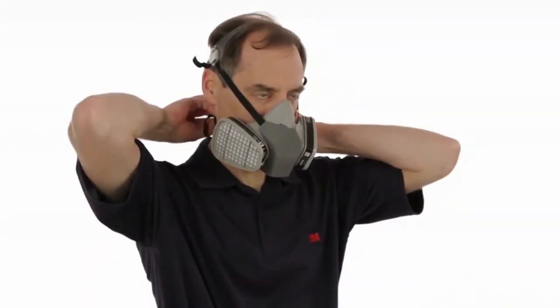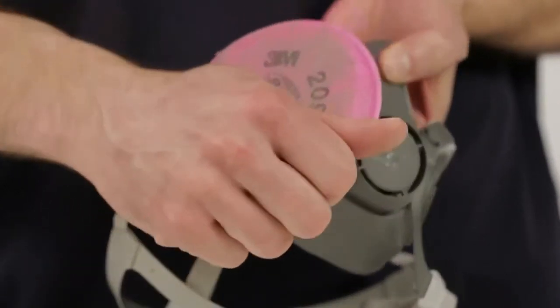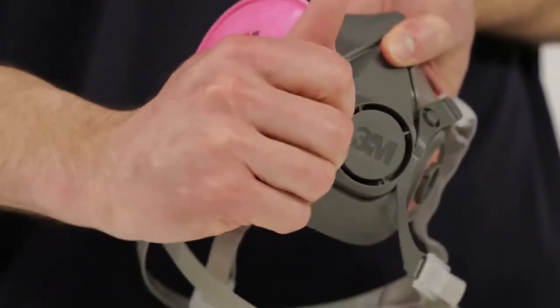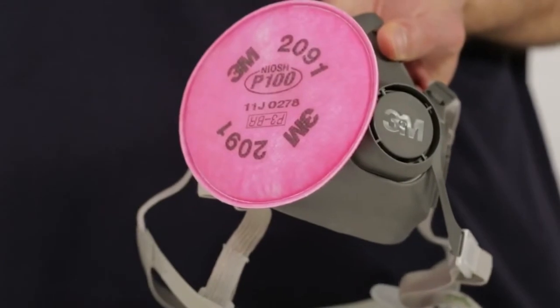To remove the respirator, unhook the lower straps using both hands, then slide the facepiece down the straps to your chest. Replacement and cleaning. Replace the particulate filters according to instructions provided by your supervisor, or when they become soiled, damaged, or breathing becomes difficult.